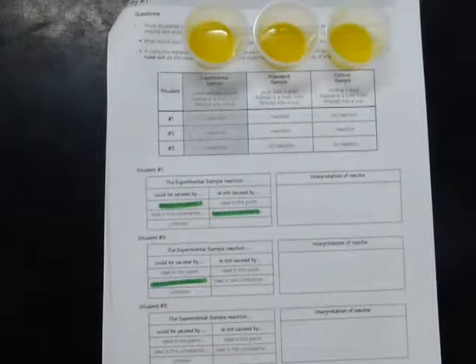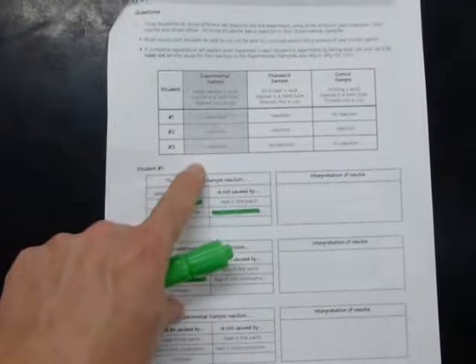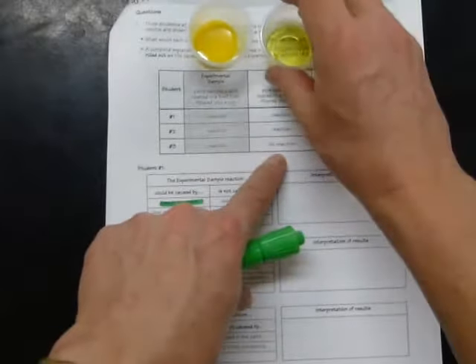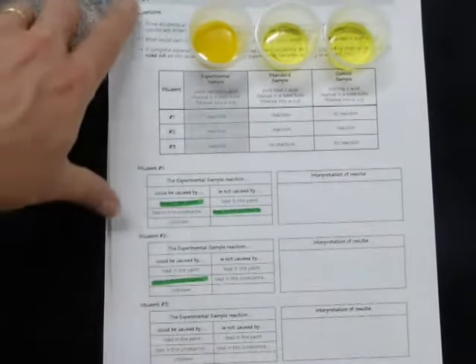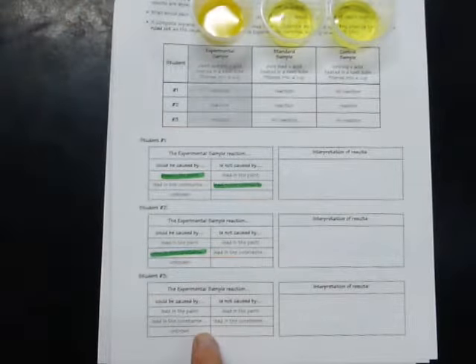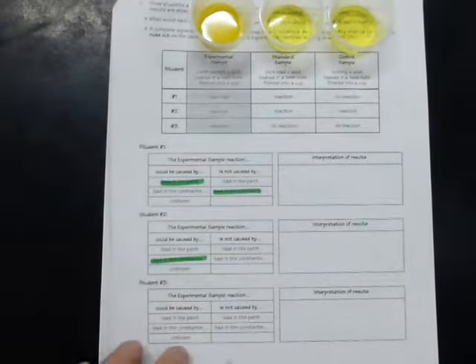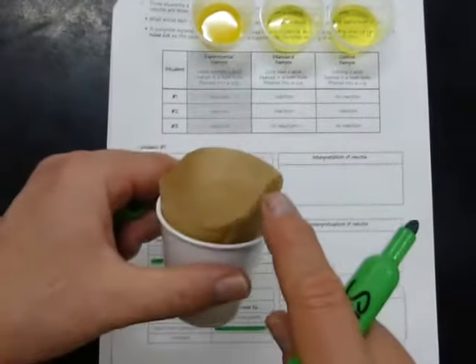So let's look at student number 3. Student number 3 sees a reaction in the experimental sample with the paint and sees no reaction with the standard and sees no reaction with the control. And we want to know, is the experimental reaction here the result of lead in the paint, lead in the constants, or unknown. So I'm looking at the constants, I don't see a reaction. So I can be pretty sure that it's not that there's lead in the constants. I can rule that out. This reaction wasn't caused by contaminated filters, cups, or tubes, or acid.